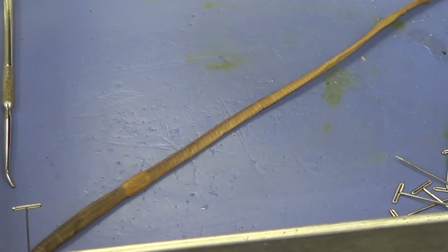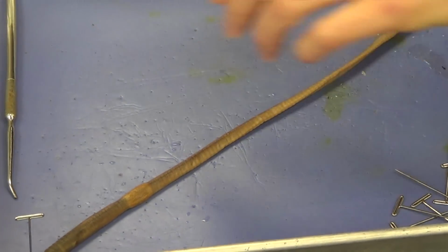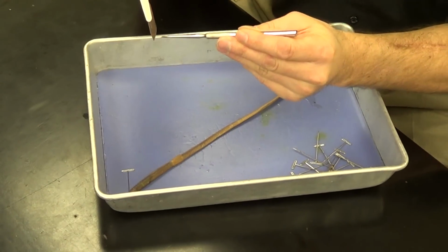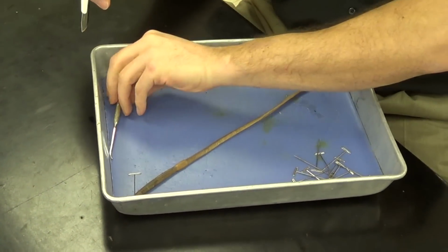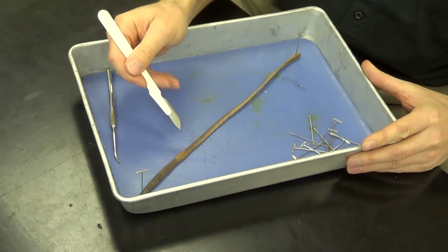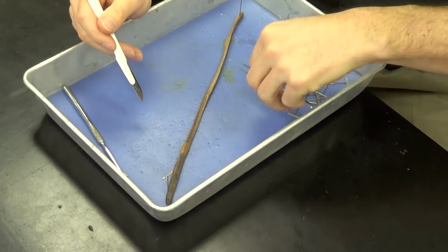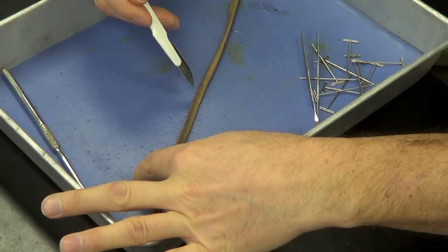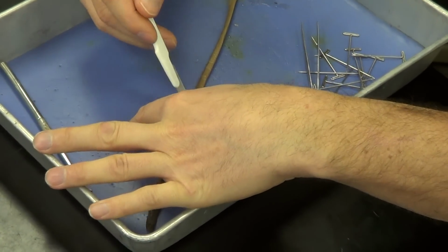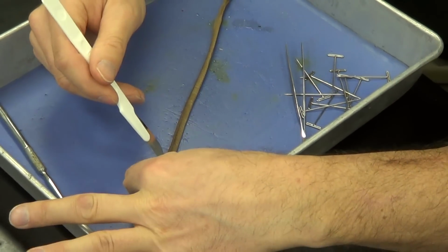So you pick up your scalpel, you're going to hold it like a pencil. And I like to use the very tip of the scalpel. So I hold it almost vertically. And I'm going to hold it at an angle also. I'm going to grab my forceps and I'm going to begin cutting. Now when I cut, I always cut away from my hands or between my hands, but never toward. You never want to cut towards your hand. So I'm going to cut away from my fingers.